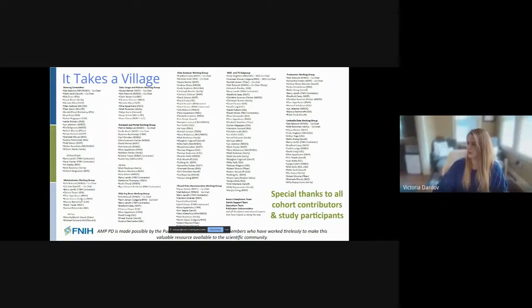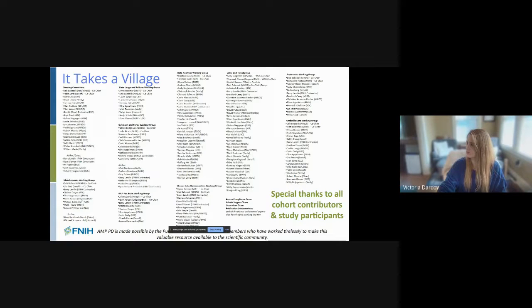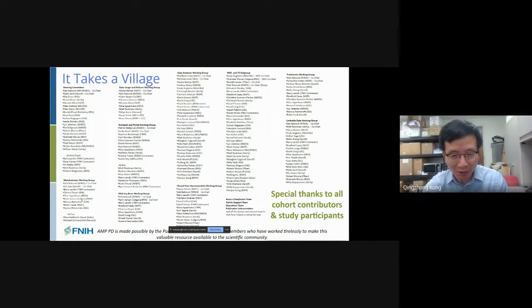Okay. Well, hi, Victoria. I actually have a question. Sorry, yeah, I'm new to this. So I'm not totally sure what exactly the platform's for. Is that, like you said, people share the data or share their software, or can somebody provide some kind of software package you can put your data in and analyze it? I'm just a little bit not sure what exactly it is.